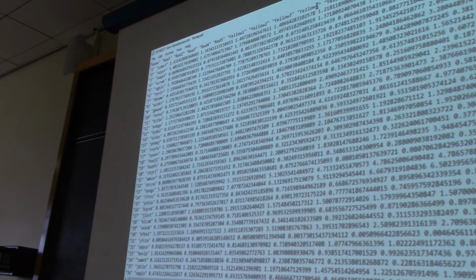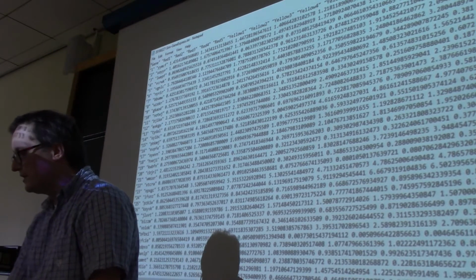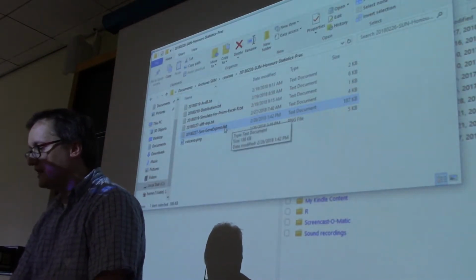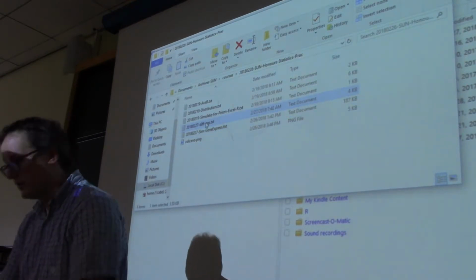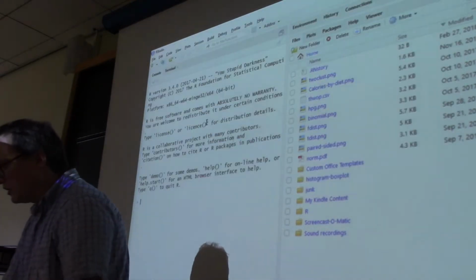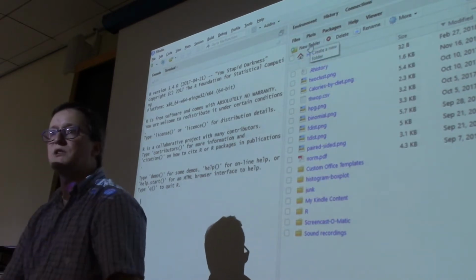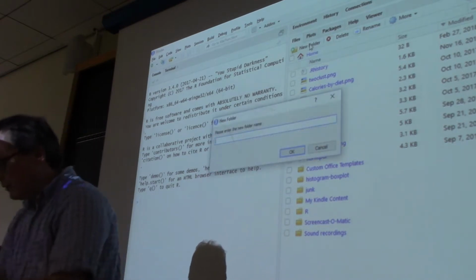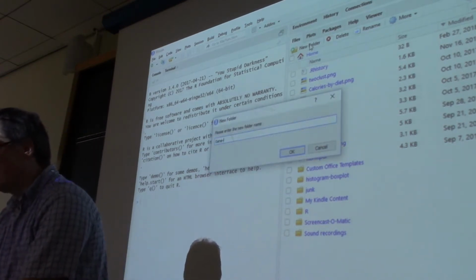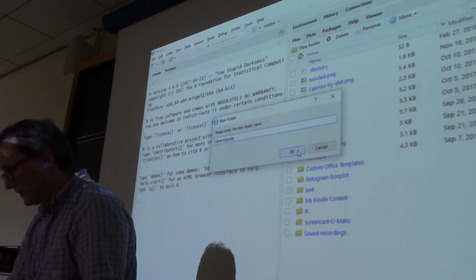Okay, grand. So these data, the sim gene express set, is what we're going to use as our test data. And then we've got this diff expression file as well that we're going to work with. So I'm going to create a new folder for this in my documents folder using the new folder option. And how about we call this gene express? So it's a gene expression exercise.